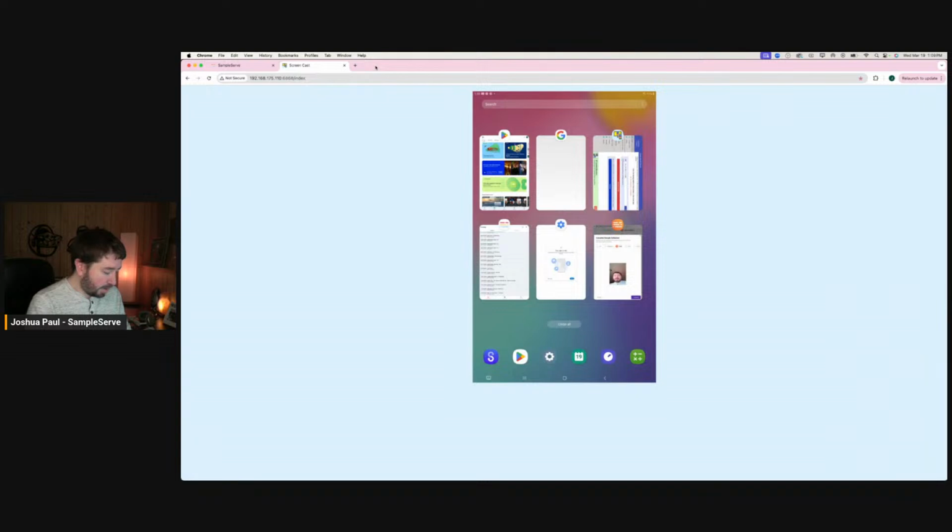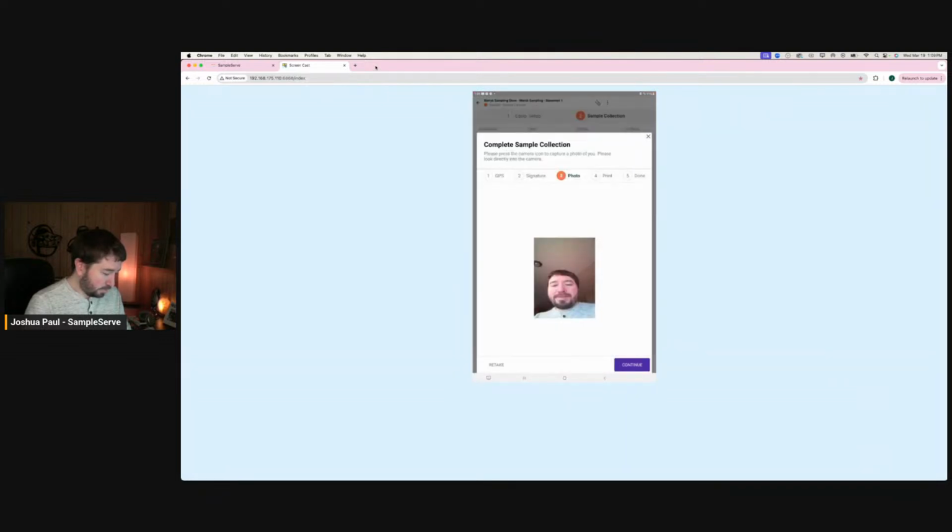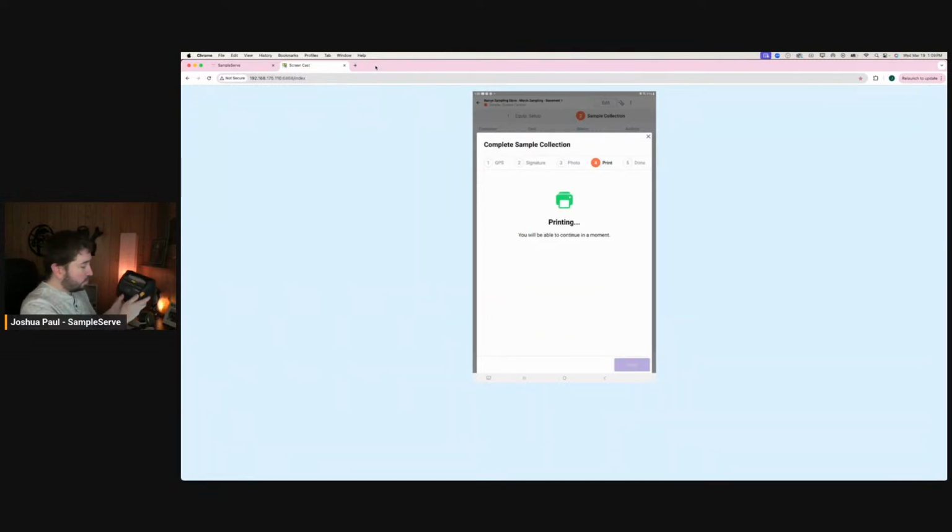I head back into my app here. Let's hit continue on the selfie. And now it's going to print out a customized sample location label for me. And what this is going to have, here, let me grab one that makes actual real sense here.